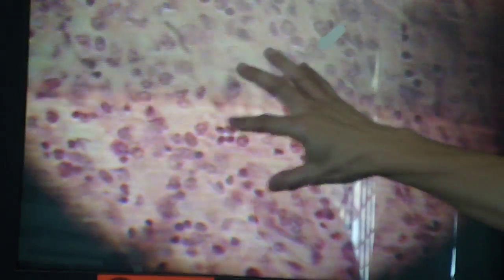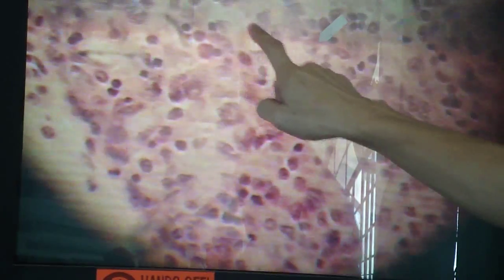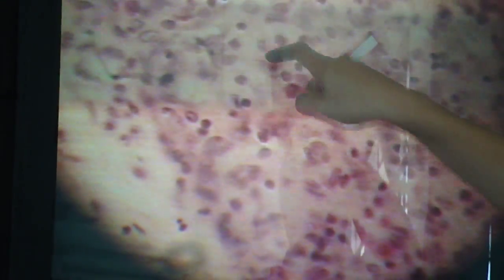The red cells there. The cytoplasm is red. These are your oxyphils. They say that the oxyphils are just degenerated or degenerating chief cells. So the majority of these are red cells here. So these blue ones are your chief cells or principal cells which secrete your parathyroid hormone.